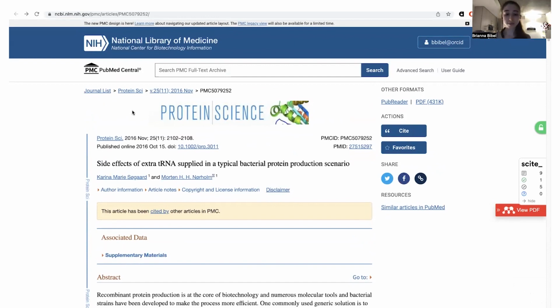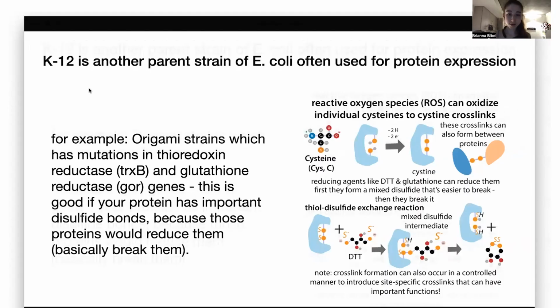So I just want to let you know that that's out there, as well as potentially problems with solubility, if you're having it make protein too fast. Sometimes it's good to pause a little so your protein can fold. In cells, sometimes our cells use rare codons because it allows the ribosome to pause a little, allow things to fold, and give things time to do that. So it can be regulatory, and the tRNA availability isn't typically an issue, even for the rare codons. But when you're trying to overexpress a protein and you need a lot of it, then that rare codon can become limiting.